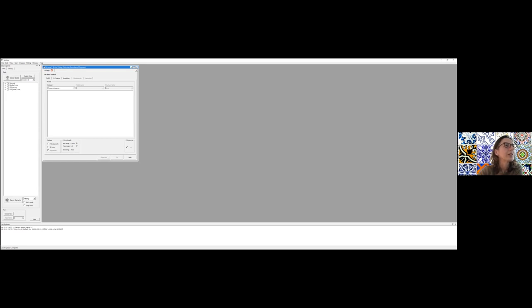So let's start with this one, lysozyme sub. I'll do the fits for this one, and then you can work on the other ones on your own. I'm going to click here, and I'm going to send the data to fitting. There are different options depending on what you want to do. If you were going, for example, to calculate the P of R, you'd send it to inversion. I didn't tell you about this invariant option, but you can also do a calculation of your invariant. You can do a fitting, you can do correlation functions. There are different options. We're going to focus on the fitting option here. So I'm going to send the data to fitting.